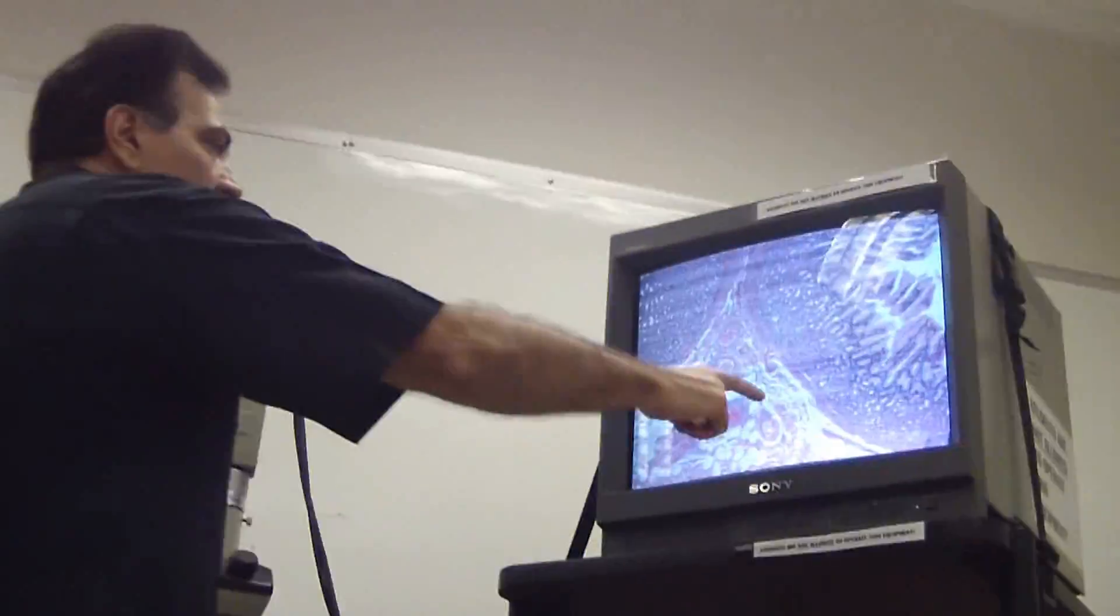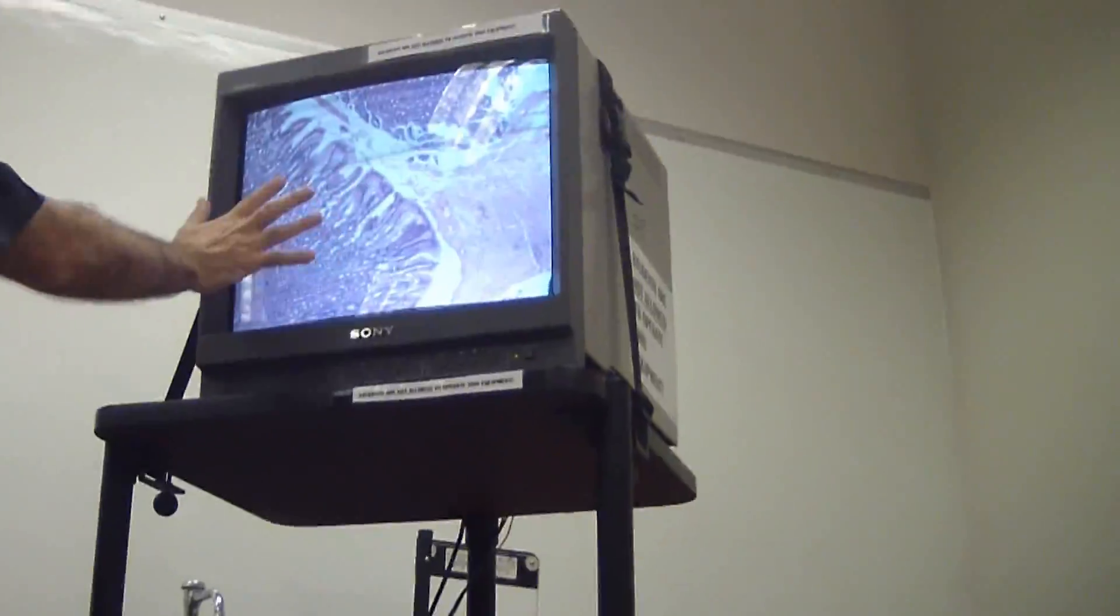Keep that in mind. Look, see how these gastric pits look, so that way you can differentiate them with the small intestine. All right, so that's the stomach right here. What is the next one?